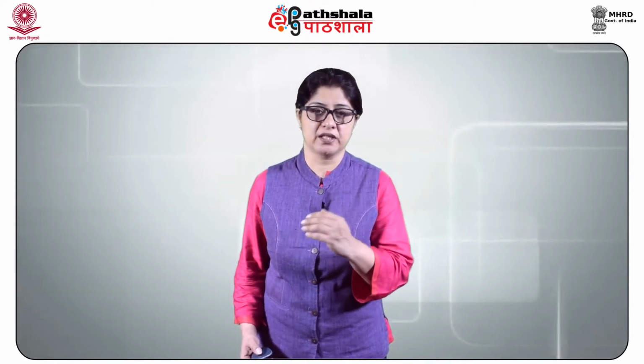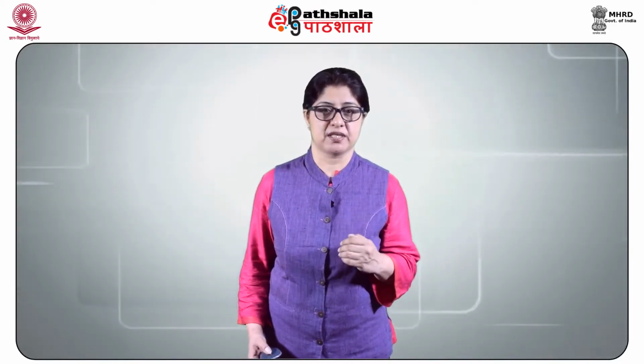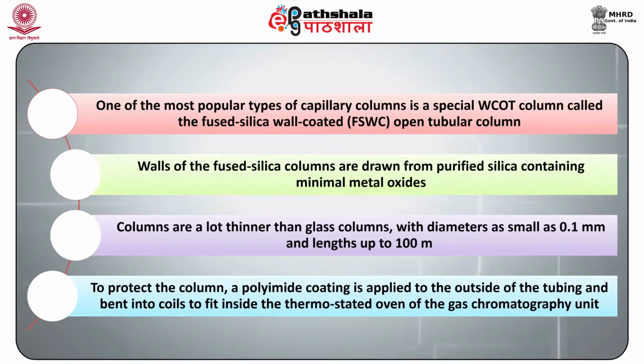While SCOT columns are capable of holding a larger volume of the stationary phase than WCOT columns, due to their larger sample capacity, WCOT columns have better column efficiencies. One of the most popular types of capillary column is the special WCOT column called the fused silica wall coated open tubular column.